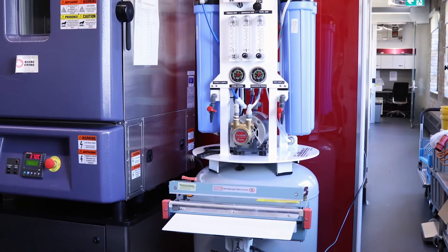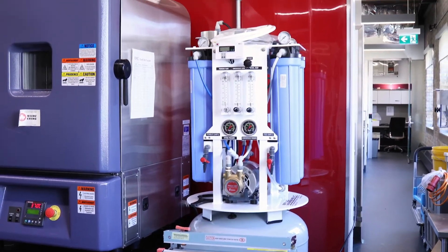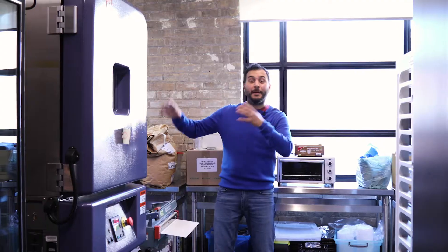We'll start with this reverse osmosis machine. This machine works with different pressures to take away contaminants from liquids.